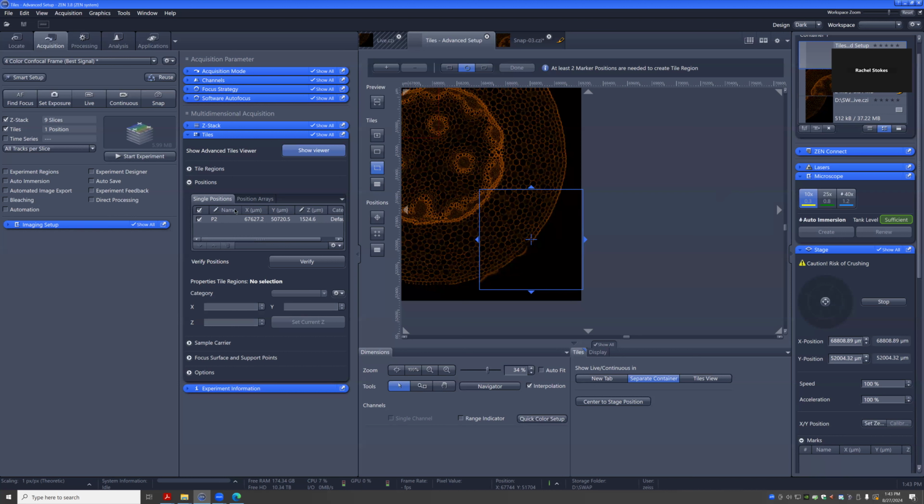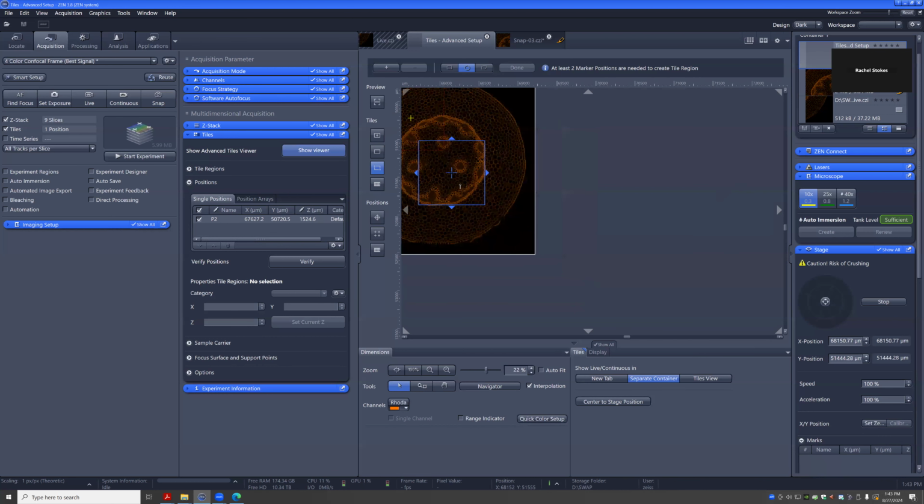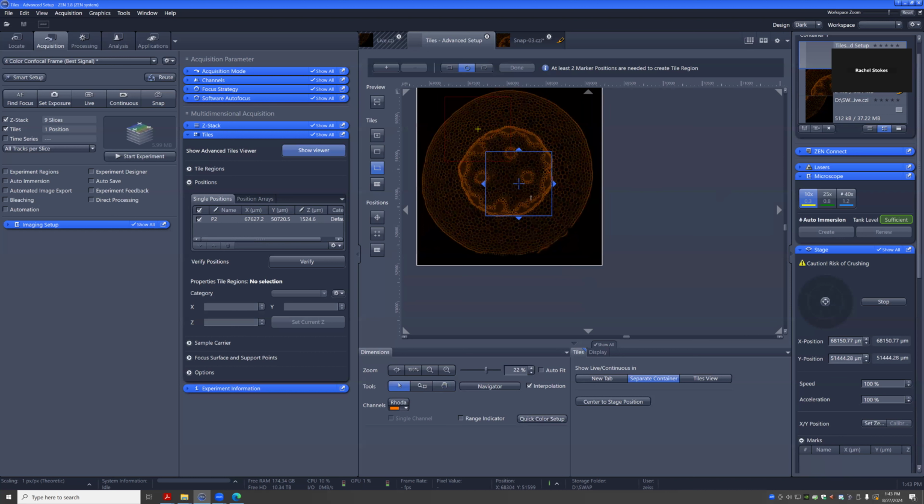So the other thing, we walked through setting up tiles and doing positions. I'd say again, there are 5 ways to set positions, right? I usually use the F10 key. That's really quick. I see this light, this is where I want it to be, I just hit F10, and it'll set the X, Y, Z.